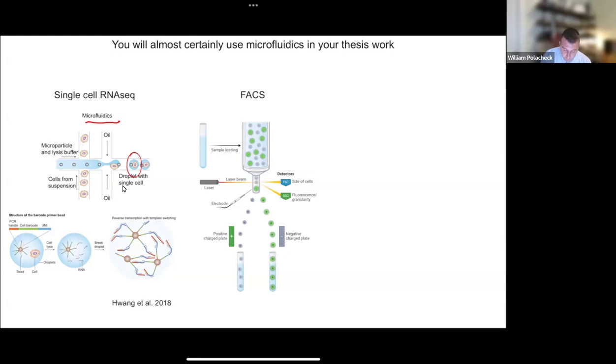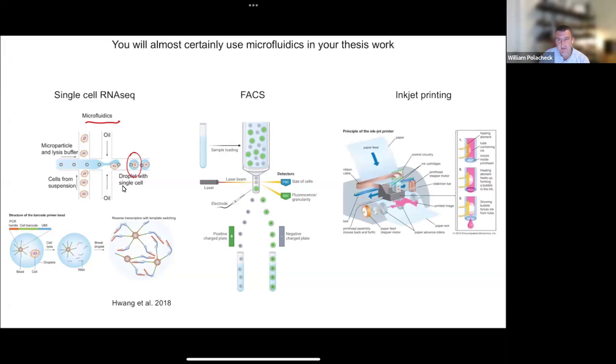This also was an early microfluidic device for biological purposes. But even if you don't work with cells or use either of these approaches, you will probably print something at some point, and probably the most pervasive microfluidic device in commercial availability is inkjet printer heads, which use actuators and phase change of inks in order to print with really high speed and resolution.